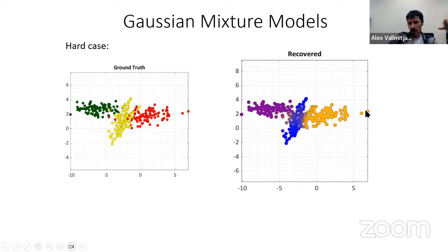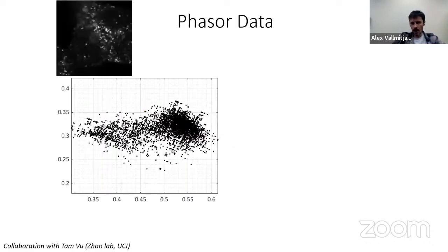As an example, say this point on the far right has a total probability of belonging to the rightmost cluster and zero probability to the other two. But some of the points in here, which we have painted in these kind of half yellow and purple, this point on this side here has a higher probability of belonging to the yellow cluster than belonging to the middle cluster. So the one on the right and the one in the middle. This can be used then in our real life problems to maybe discard some points, or consider it as a mixture of populations, or whatever it is.